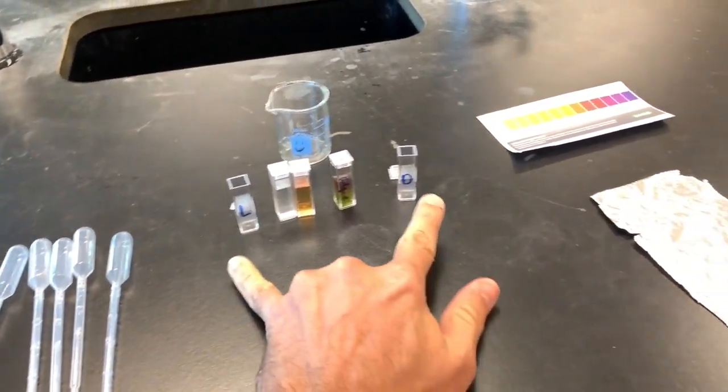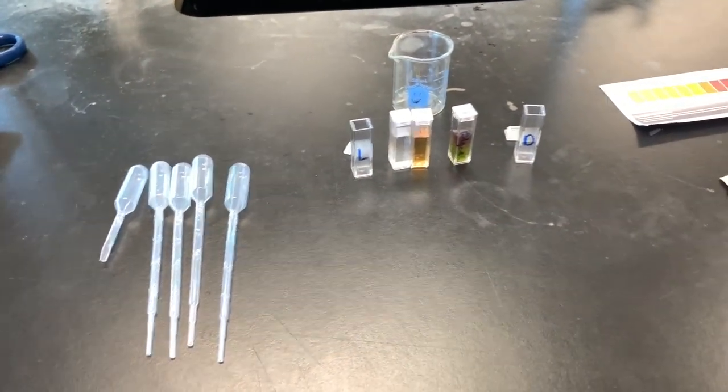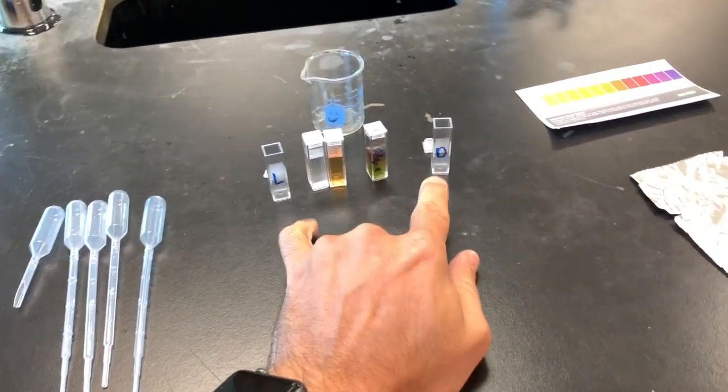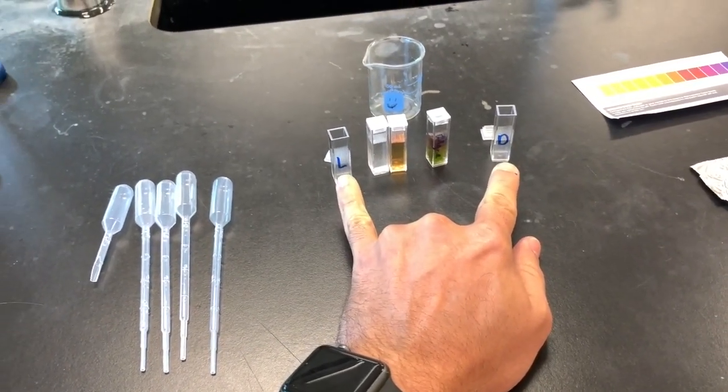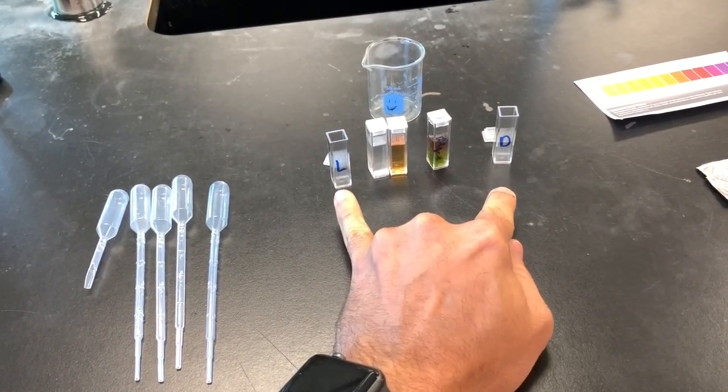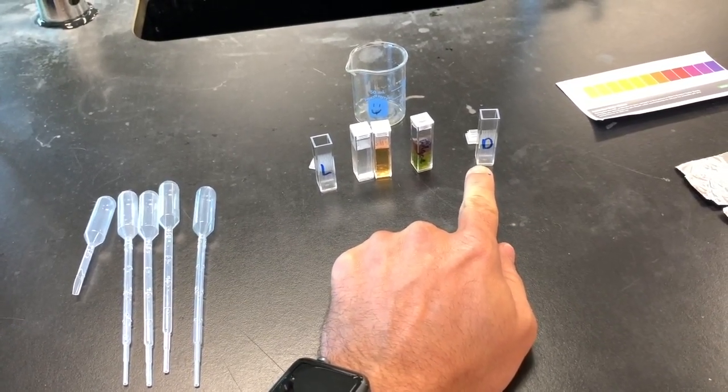So step one is going to be, if you look at your protocol sheet, which will also be here at your lab station, which is these steps I'm going over right now, the first thing you're going to do is label the two empty cuvettes L and D. One is going to be for the algae beads that get placed in light, and the other one's going to be the algae beads that get placed in the dark.